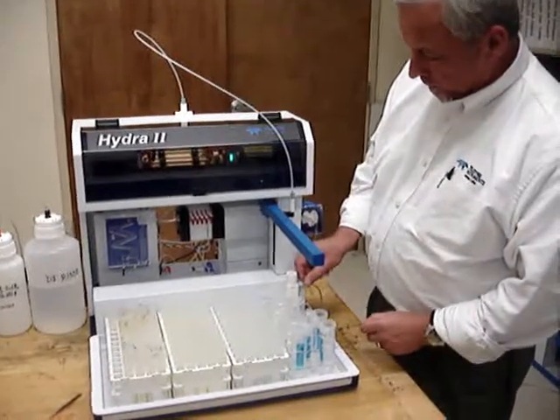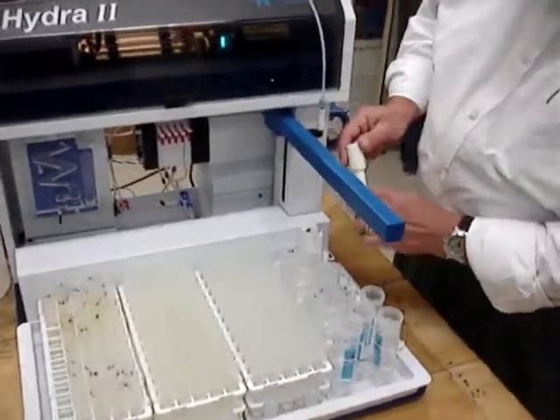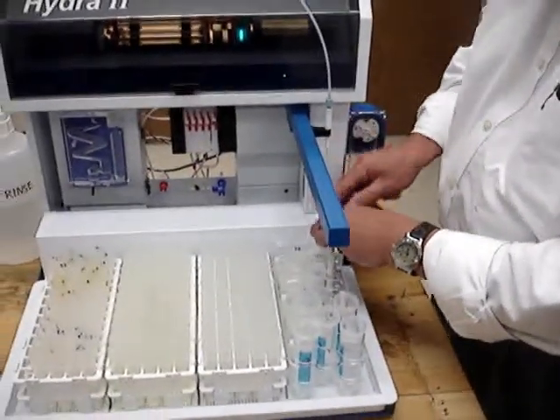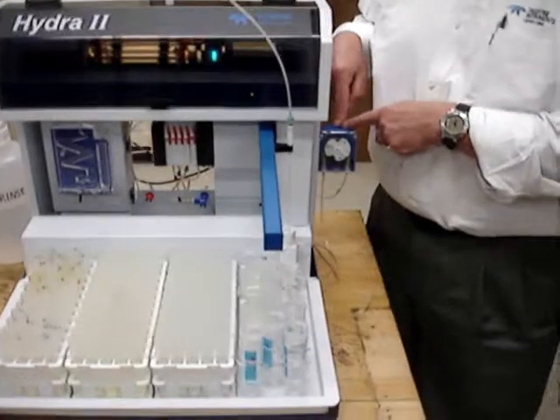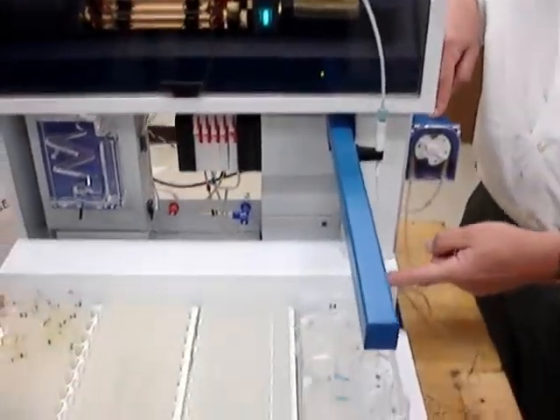There is also a built-in rinse station. The built-in rinse station is easily removed, cleaned, and returned. It has its own stand-alone peristaltic pump for refilling the rinse station.